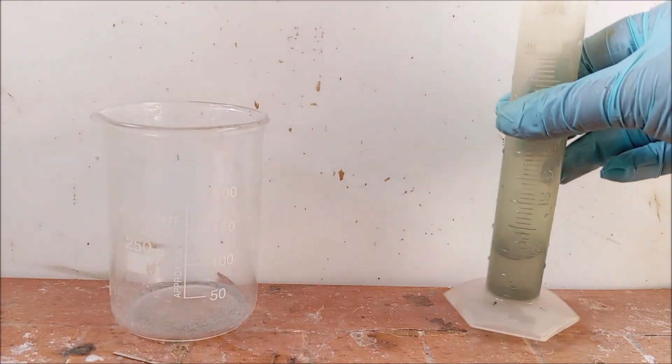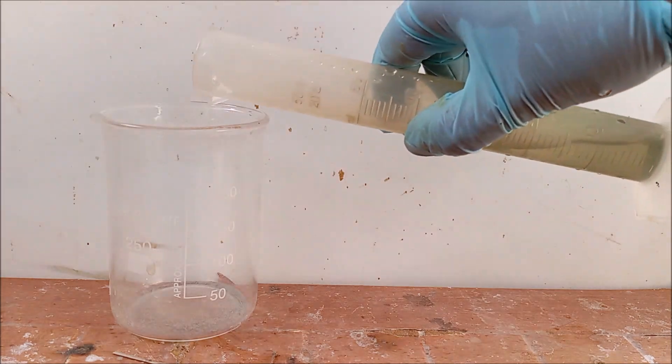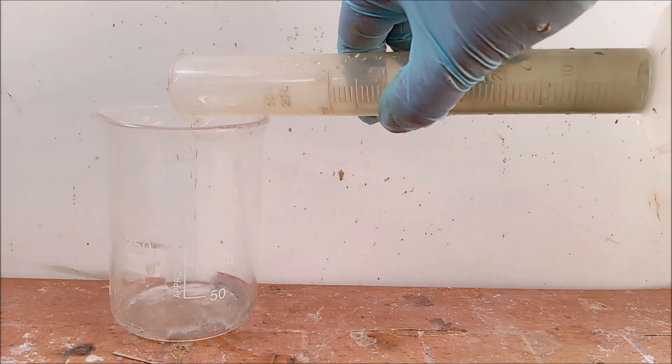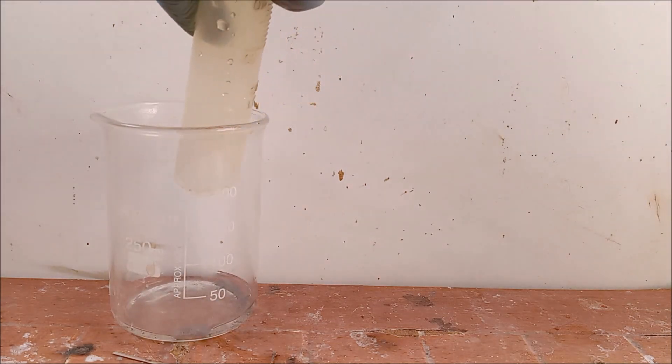Take 0.6 gram of nickel metal in a beaker. Add 10 milliliters of 1 molar sulfuric acid to it. A little excess of acid can be added later if required.